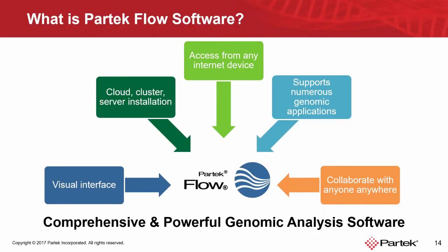Partek Flow is our package for comprehensive and powerful genomics analysis. Once installed on a cloud, compute cluster, or a server, Partek Flow can be accessed from anywhere in the world using a device with an internet browser. All the analyses are performed via an intuitive graphical user interface. Partek Flow supports numerous genomics workflows and, among other features, facilitates setting up collaborations across multiple centers.